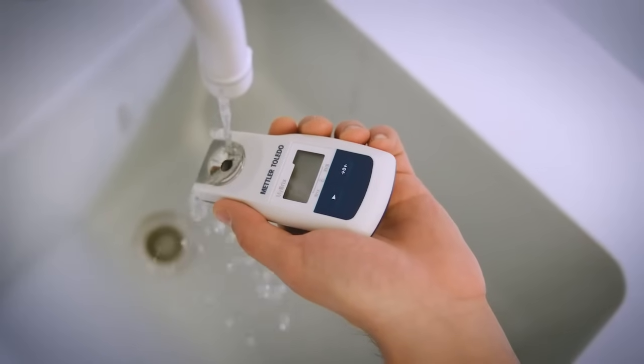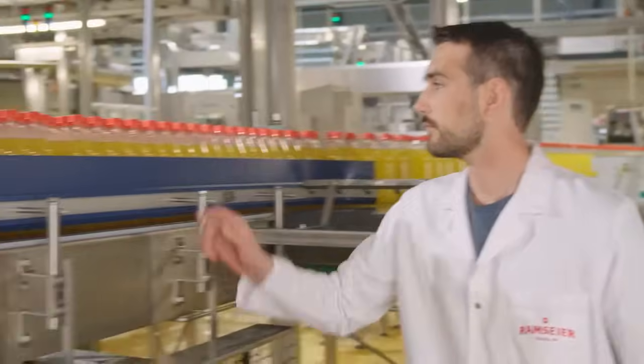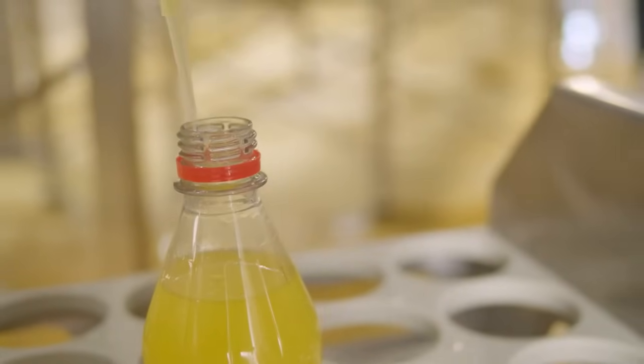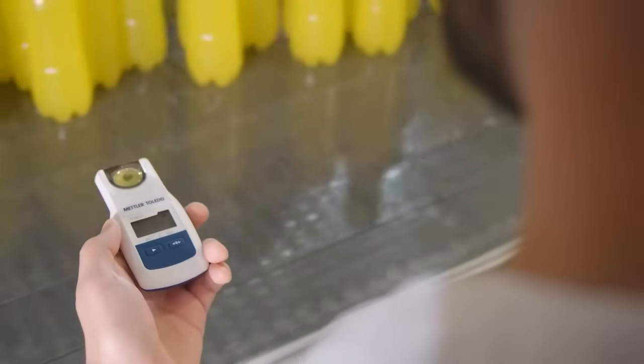Easily clean the prism dish to move on with another sample. Benefit from a waterproof and robust design. Mettler Toledo's MyBrix features all that.